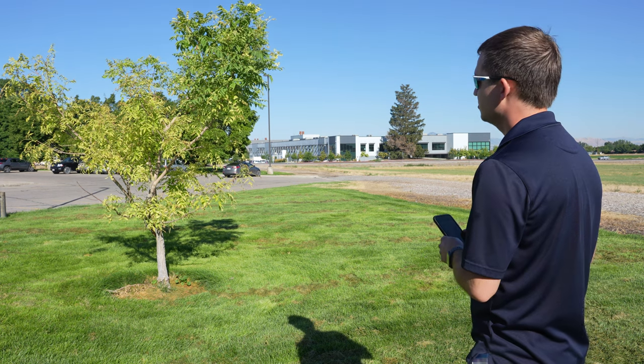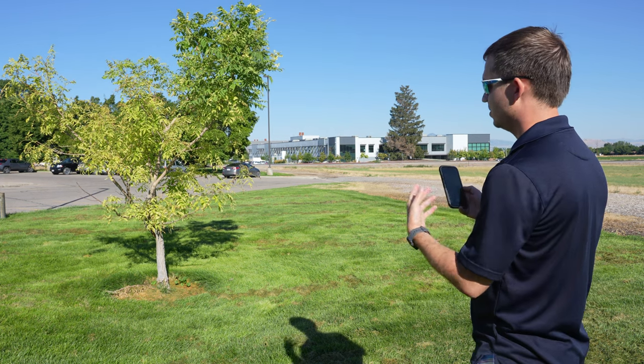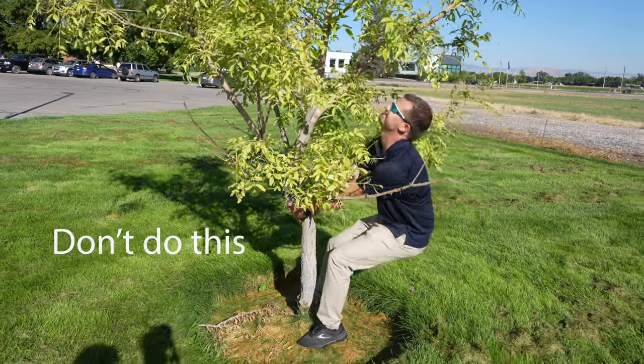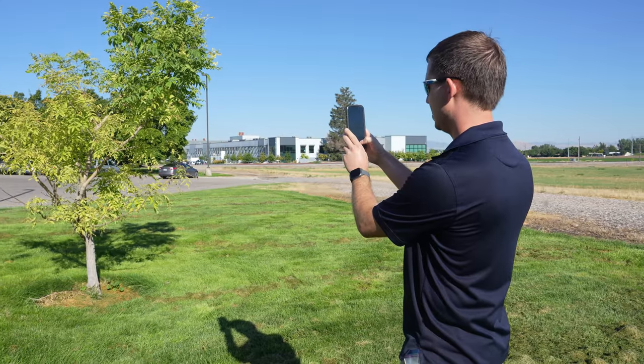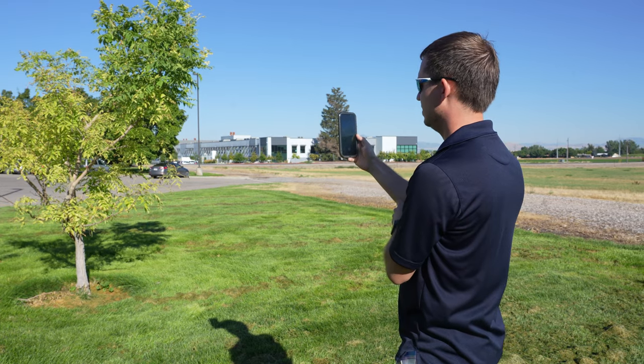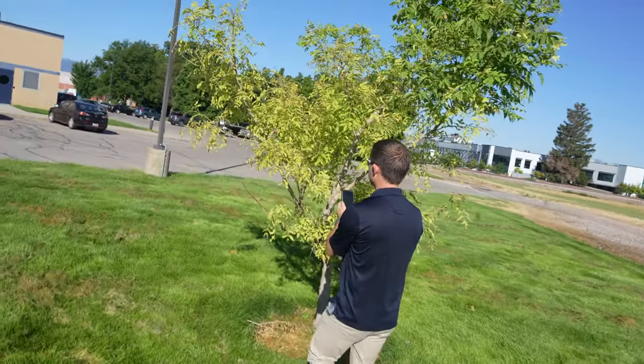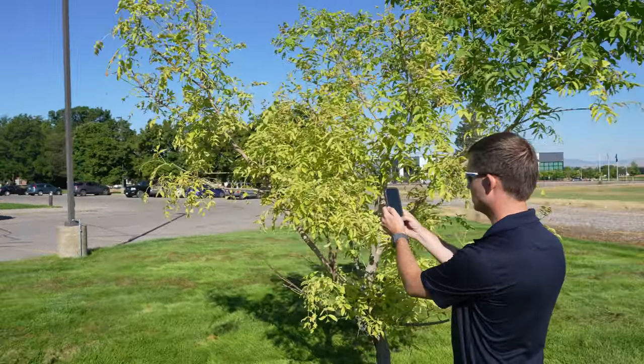Sometimes the plant is too large to collect the entire sample, so you want to get a good representative sample from that particular plant. In this case, we're going to take another photograph from far away so we can see how that plant is situated in the landscape, and then take a couple of closer-up photos to see the symptoms on the tree a little bit better.